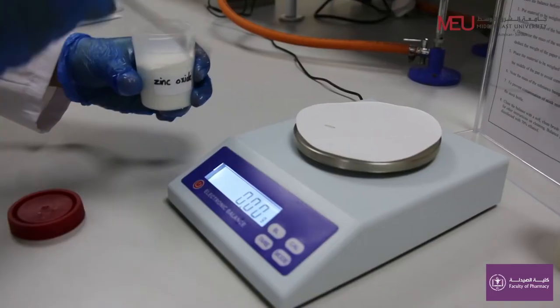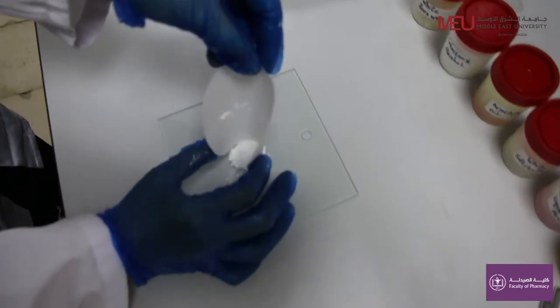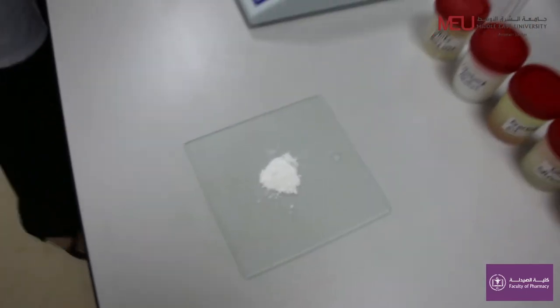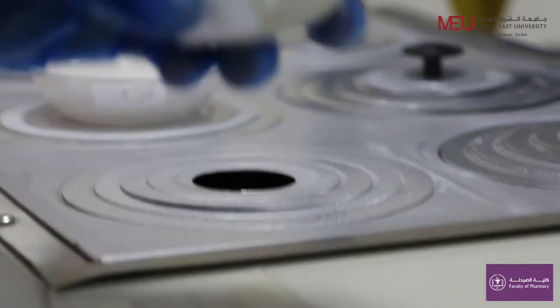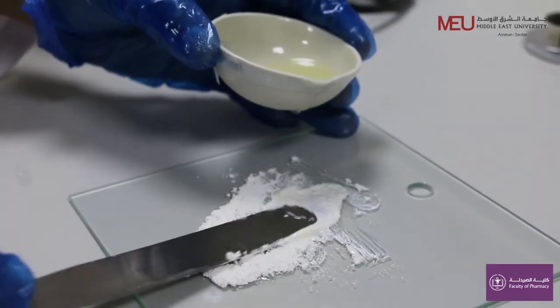Weigh 1.87 grams of zinc oxide and place it in the middle of the tile. Triturate the zinc oxide with a suitable quantity of castor oil — 8.13 grams total — until smooth.